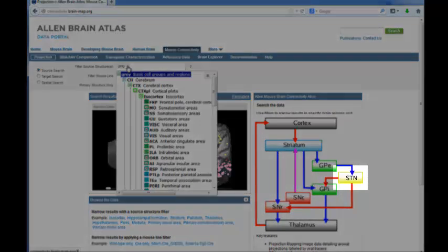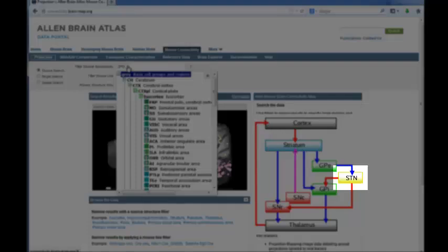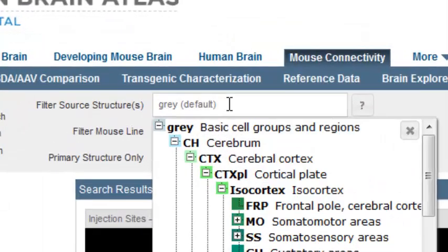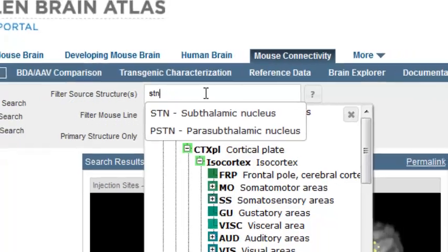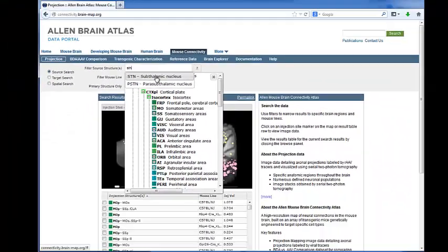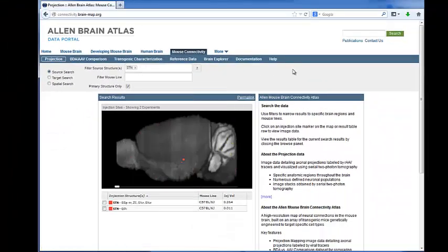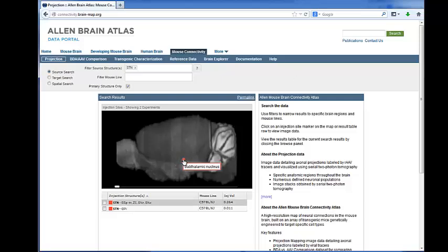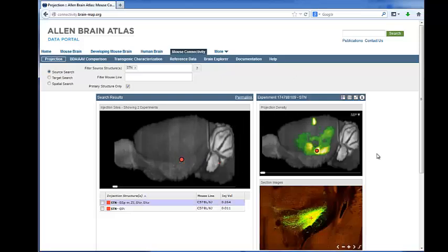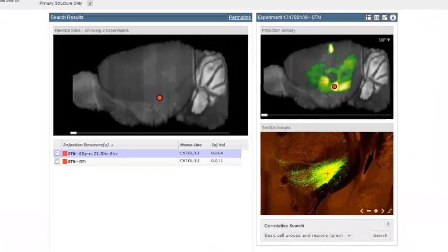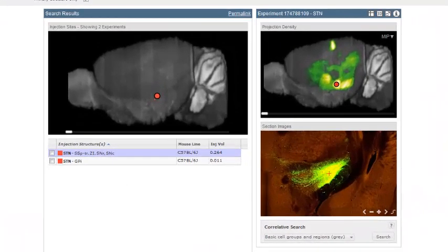Let's start by looking for experiments with injections in the subthalamic nucleus by typing STN in the Filter Source Structures text box. You'll notice that there are now only two experiments displayed, both as dots on the visualization and listed under the image. Clicking on one of the experiments will bring up that experiment in the right-hand panel and allow you to look in more detail.